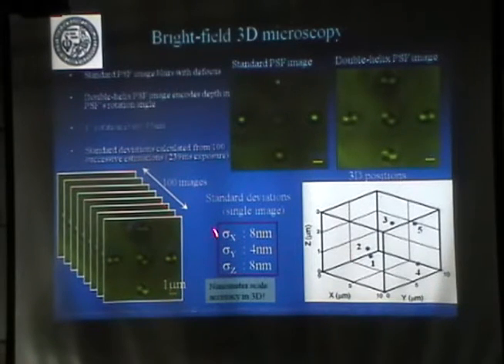Now, how do you tell the precision, the absence of random errors in your measurement? You make that measurement multiple times and look at the variance. So that's what we do here. Measure 100 times, and this is the variance. This is the standard deviation.